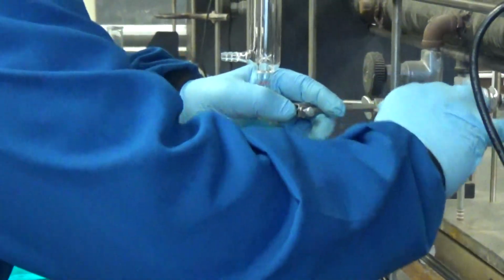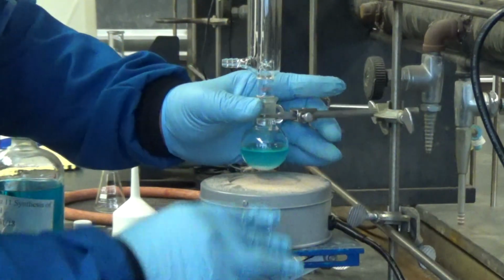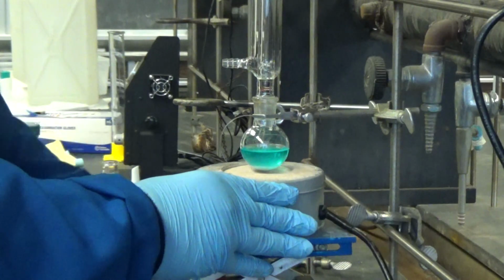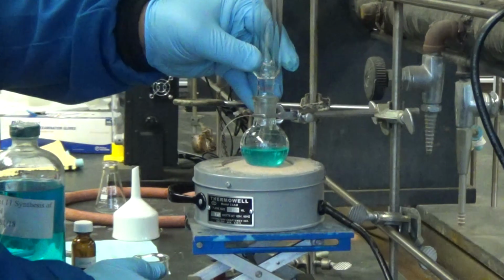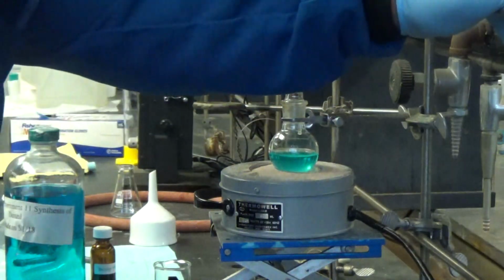Bring that down. Is the sand bath hot yet, or are you? No, not yet. Right now it's room temperature. Okay. I normally just stick my hand in it. There is no problem with that right now because it's not hot. Last time that was too hot. You preheated it.